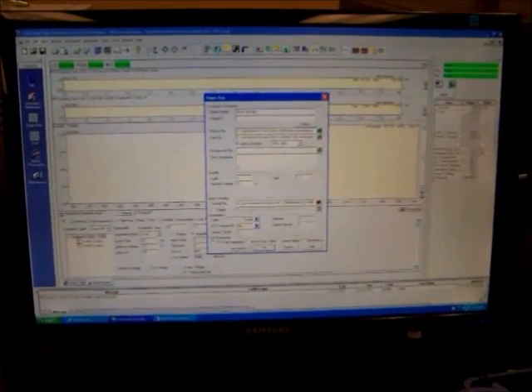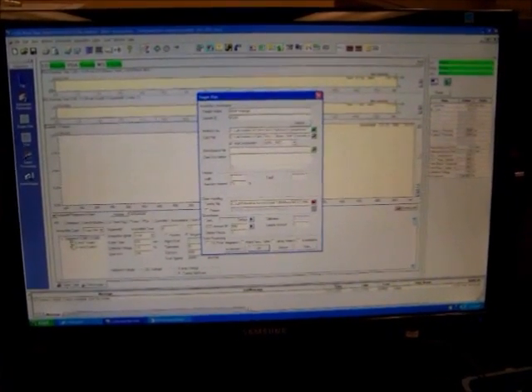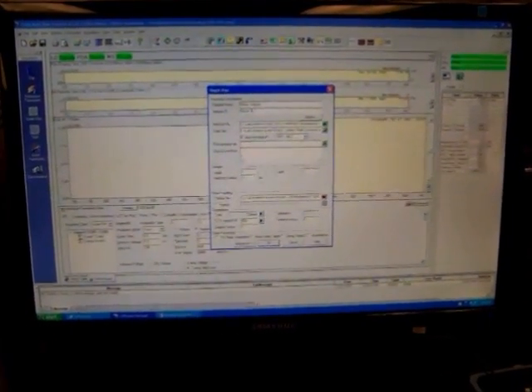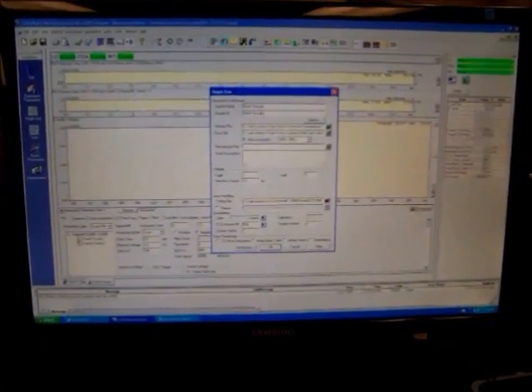Sample ID, in this instance, is going to be the same. 60 micromolar Naringin.